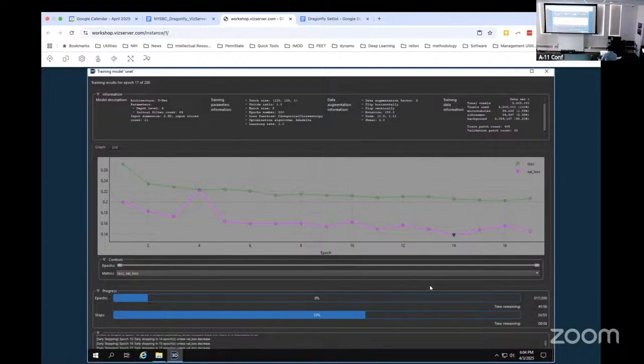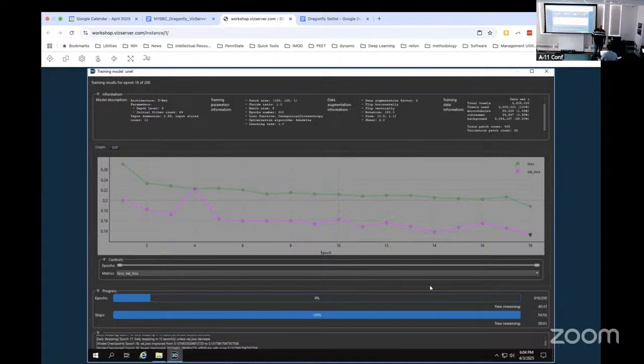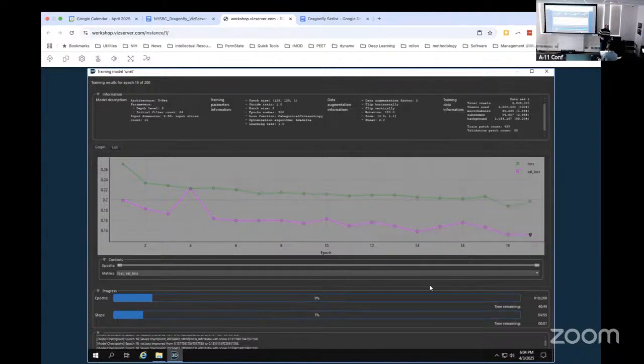They have to be the exact same dimension. So if the thing you cropped was a little bit different than the one I did, the output is based on whatever you put into the input. So you might just have a slightly different one.